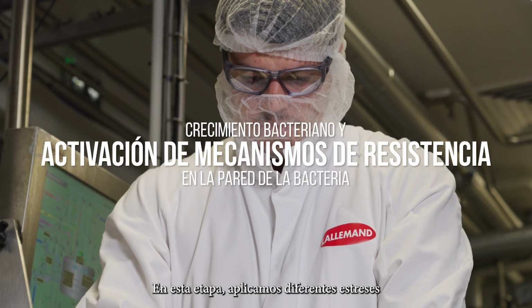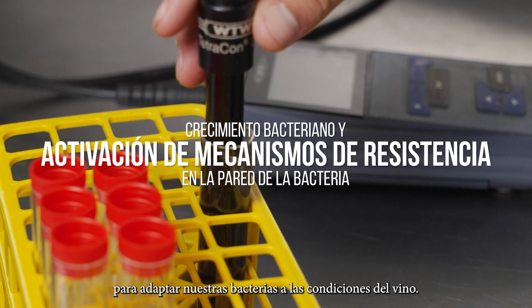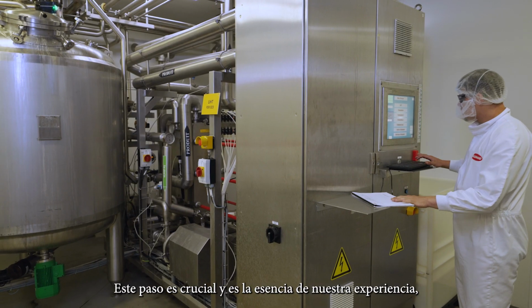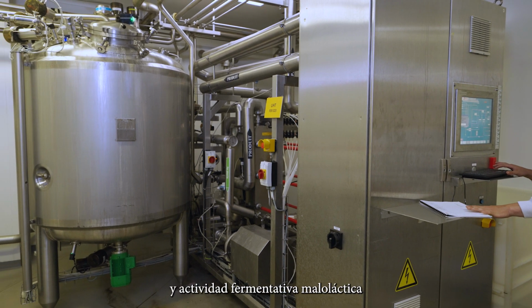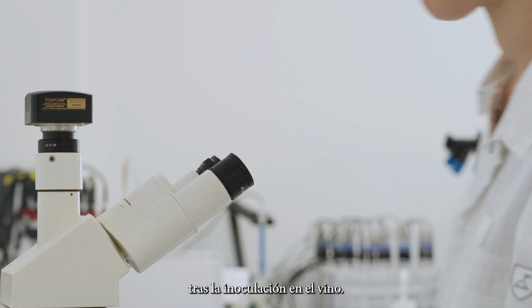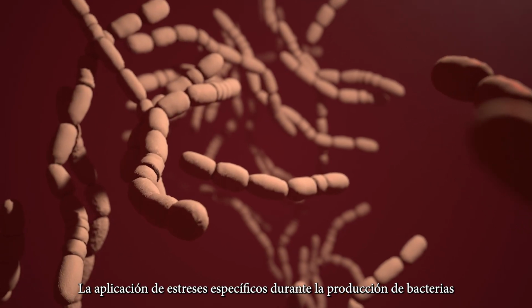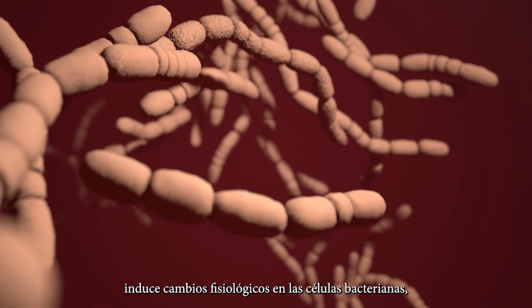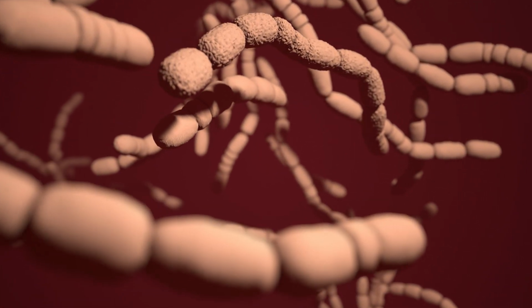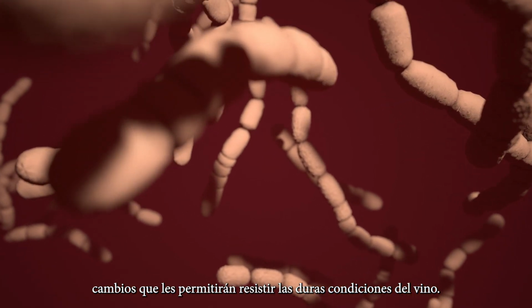At this stage, we apply different stresses to adapt our bacteria to wine conditions. This step is crucial and at the heart of our expertise to ensure the good survival and malolactic fermentation activity after inoculation in wine. The application of specific stress during the production of the bacteria induces physiological changes in the bacteria cells, changes that will enable them to withstand the harsh conditions of wine.